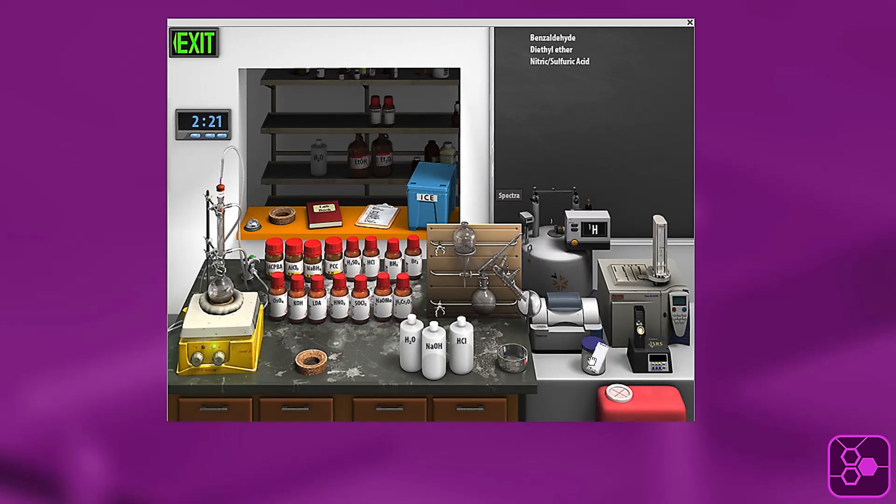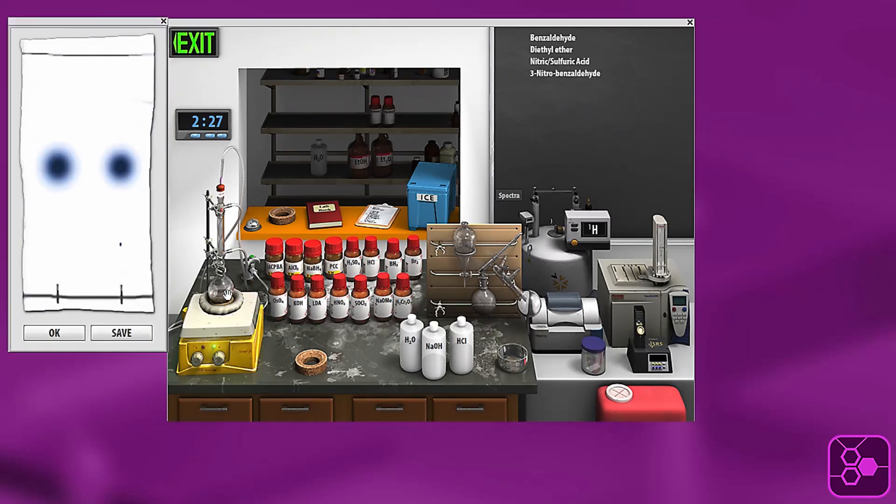I'll drag over another TLC plate right away and you can see the reaction has already begun to happen. So now we have this little spot in our products lane showing that we're beginning to form the 3-nitrobenzaldehyde which is the product for this reaction.